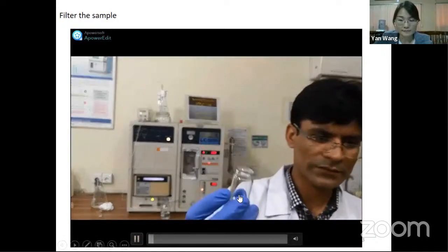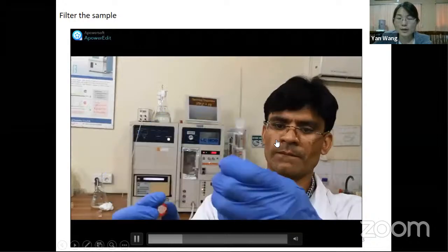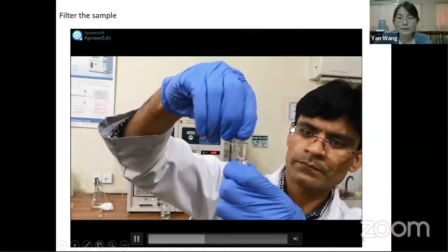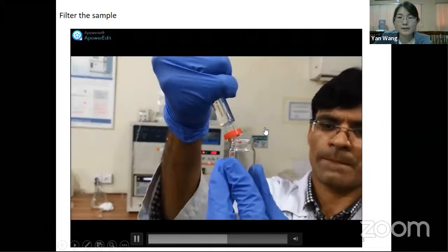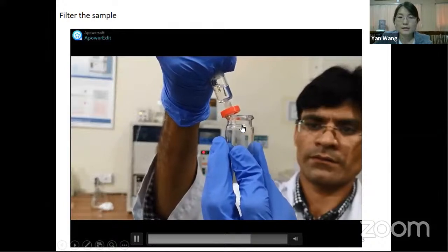Now, okay, from here, he will filter the sample. Okay, this is a clean one. You know, we are going to filter the sample, we get a very clean solution. So we have to use a very clean vial or tube, whatever, to collect the clear solution. It has to wear the filter on the injection. And here, if we go to the vial and we gently press the injection, not very hard, right? Gently and softly, so the solution is coming.